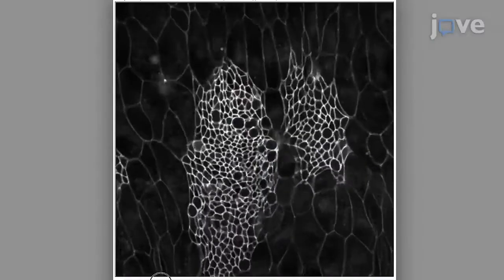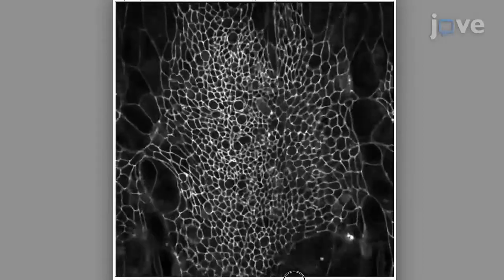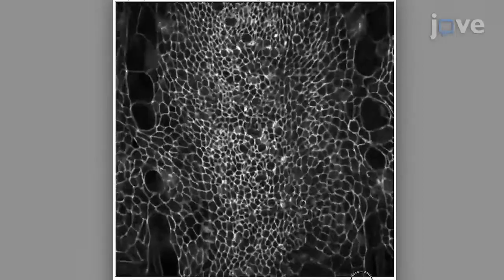Within multicellular organisms, tissue displays high degrees of order in their spatial organization. Cells align and display oriented polarity over large distances over the course of morphogenesis. To understand how the planar arrangements of epithelia is reached during development, it is crucial to track cells' orientations and growth dynamics with high spatiotemporal fidelity in vivo.